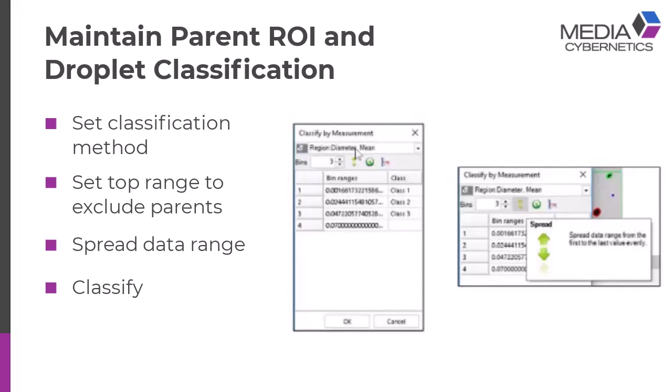One thing you just want to be careful of, whatever parameter you're selecting, make sure that the top level, in this case the top size of that bin, does not include the parent. And I'll just show a quick example of that. And then, you can name the class as small, medium, large, whatever is appropriate, or give it size ranges. Here, I just did it using the default values of finding the min to max regions.